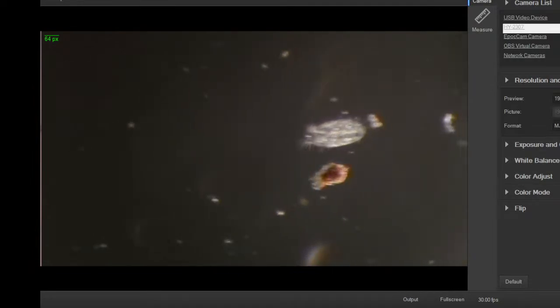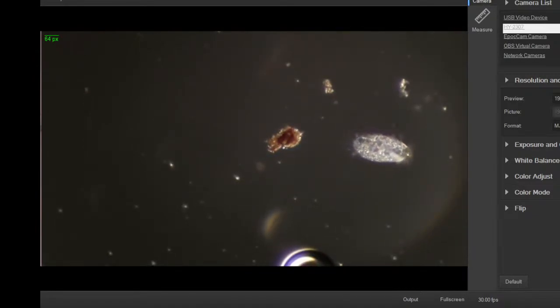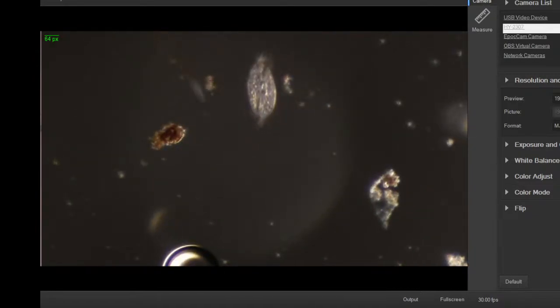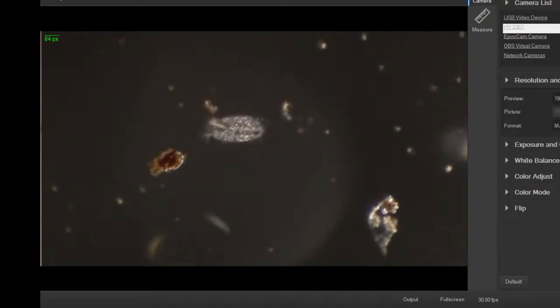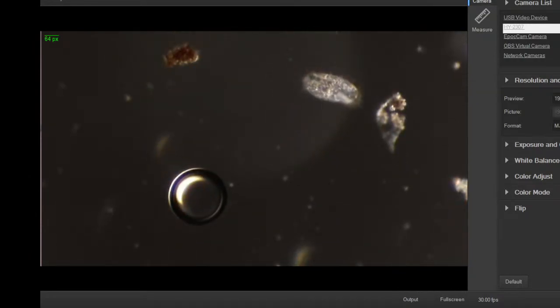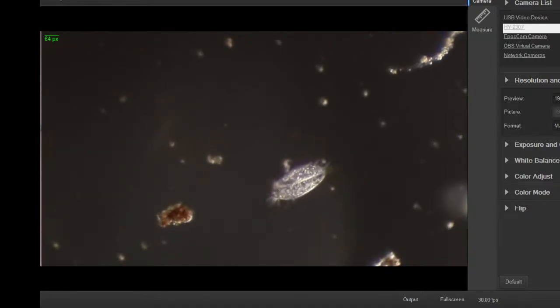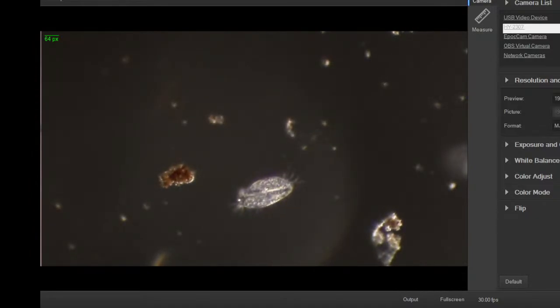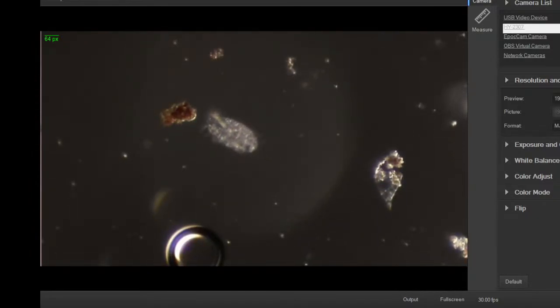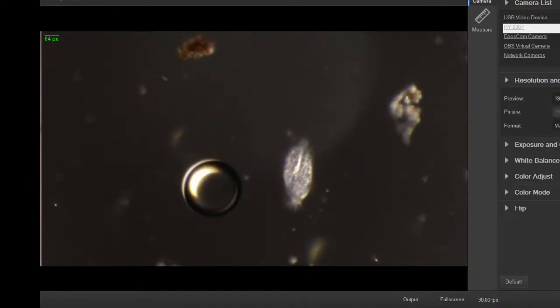In this case, the cilia and the cirri, the thicker cilia, fuse together at the top and bottom. And they're actually quite long too. They stick out further than the rest of the cilia, it seems. And he's got all kinds of little characters swimming around him. You can see the cilia pumping action as it's cycling around, drawing in stuff, creating little microcurrents. Sometimes that's a feeding thing, sometimes they're just moving stuff around and it bounces off of them.